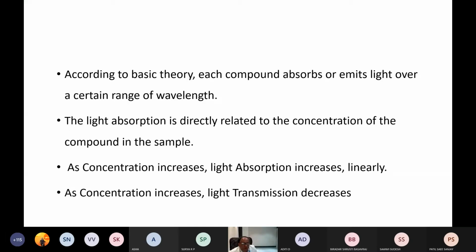But in the spectrophotometer, usually you will have a wide option of wavelengths to be measured. The absorbance cannot be a limited one. The absorbance range can be from 0 to 2.5, whereas in the colorimeter, the absorption range is limited to hardly 0 to 0.7 or 0.8 only.